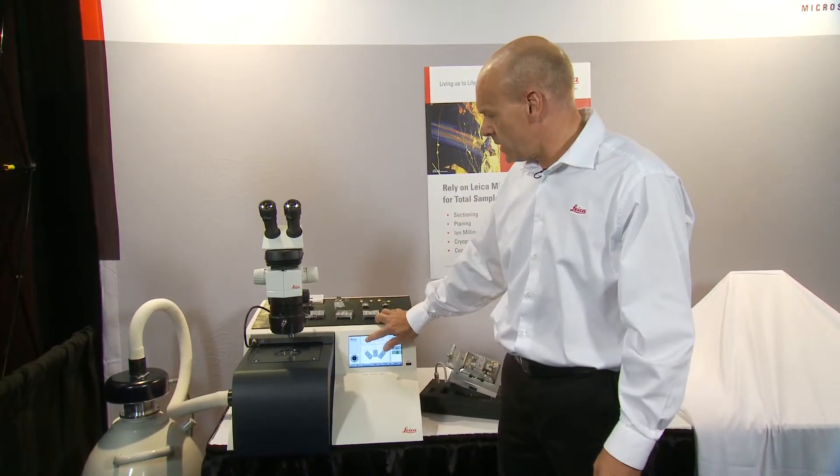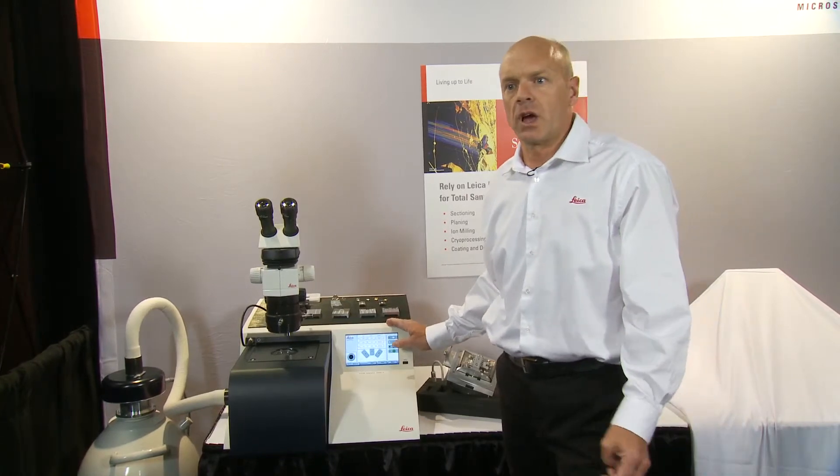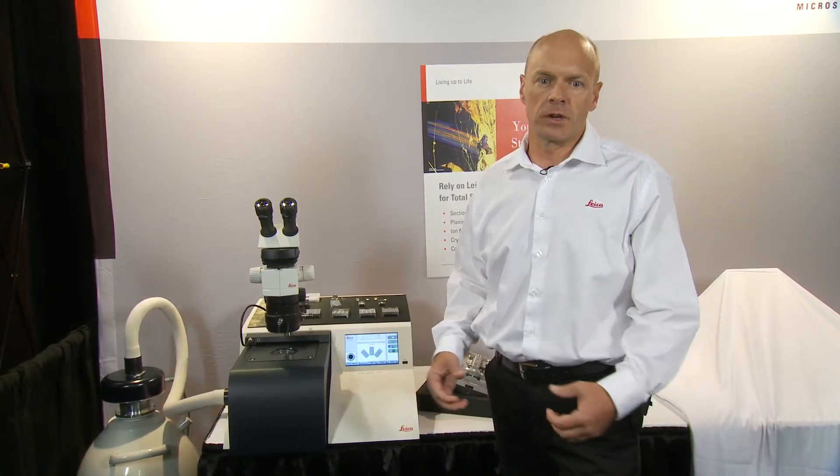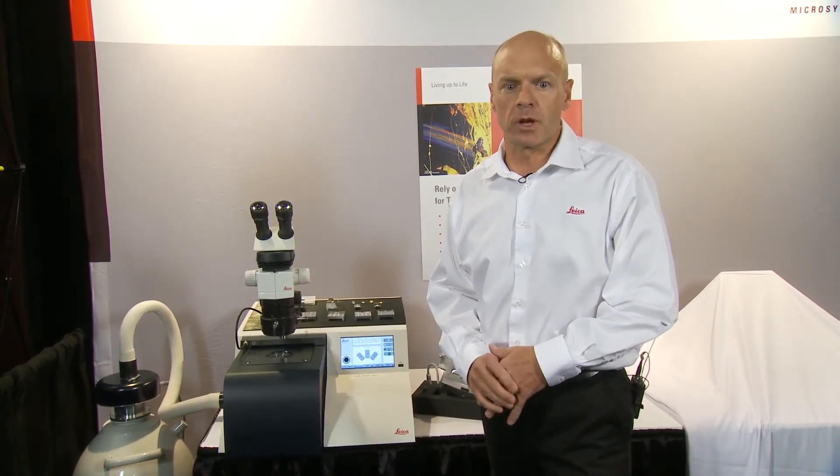The beam energy is adjustable from 1 to 10 kV in a simple process on the touchscreen. This allows us to work with either very rapid sample preparation or with a very gentle sample preparation for more delicate samples.